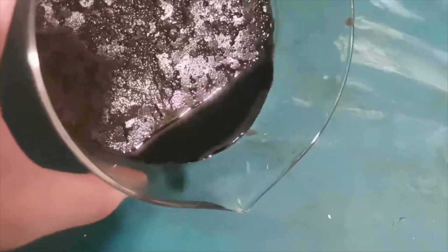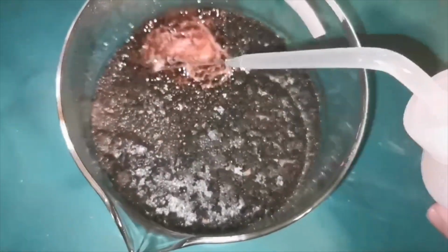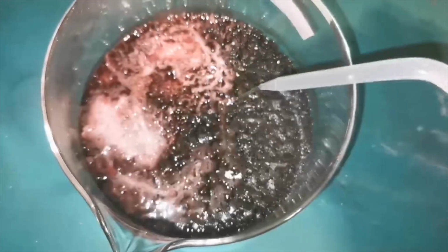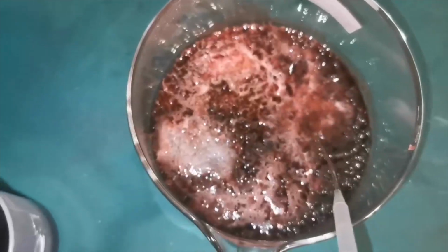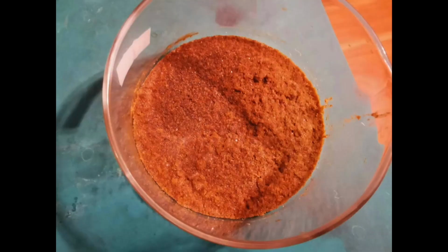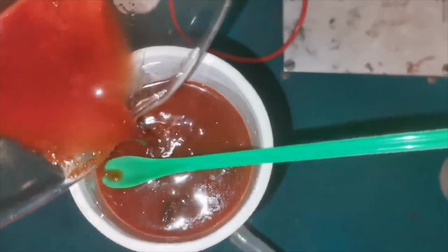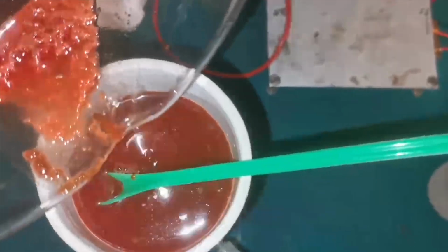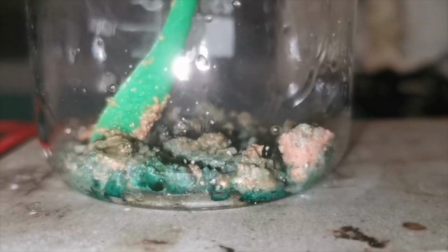I decanted the dark blue supernatant and added some water to the crystals to wash them. Surprisingly, the crystals instantly turned pink when they touched the water, and I was really happy to see my product appearing. I then decanted the supernatant and allowed the crystals to dry in air. I came back to my crystals 1 week later, and all of the water evaporated. I added some water and filtered the mixture to remove the impurities. I washed the crystals once with water and once with ethanol, and transferred them to a hot plate to dry.